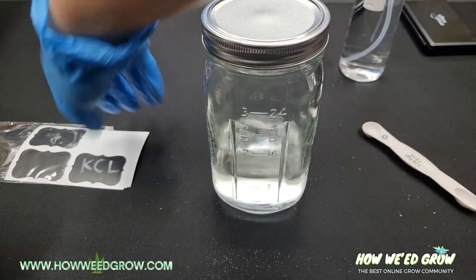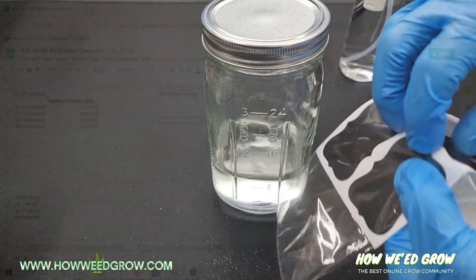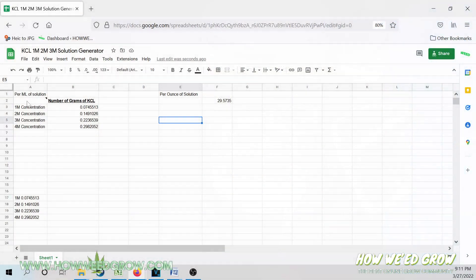In this video, I'll be making an 8-ounce solution at a 3M concentration, so I'm just going to go to my generator and input some fields. Notice that it says enter the amount in milliliters.